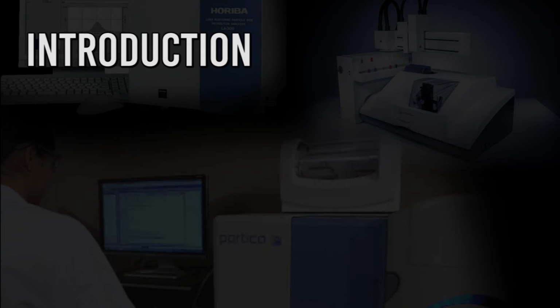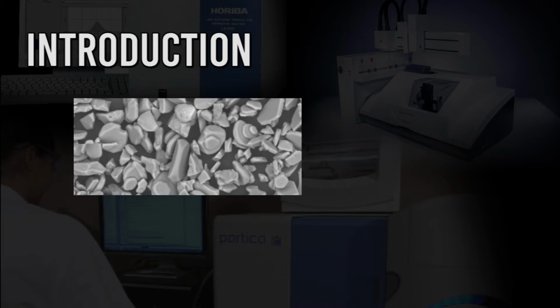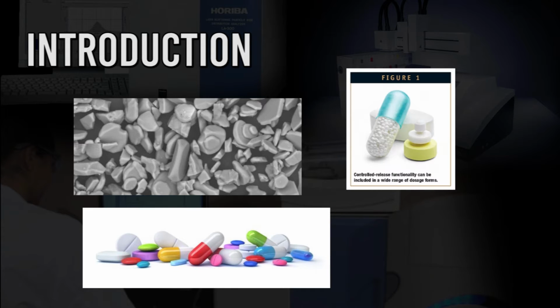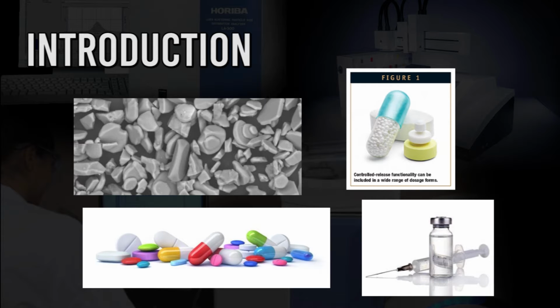Particle size is an important attribute in active pharmaceutical ingredients, in solid oral drug products for manufacturing tablets and capsules, together with the sterile liquid products, that is, injectables.